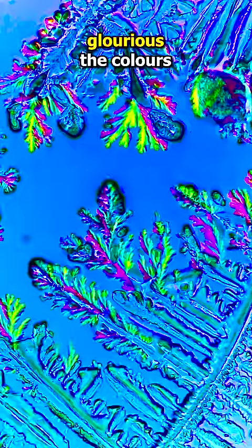I've never seen this before, and when I zoomed in, I saw the most beautiful thing. The tears began to glow a beautiful spectrum of colors, but it is bittersweet, because the more tears you cry, the more glorious the colors. It creates an artwork that will never be repeated again.